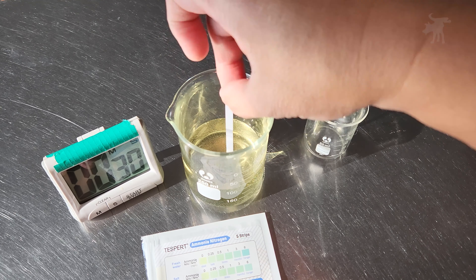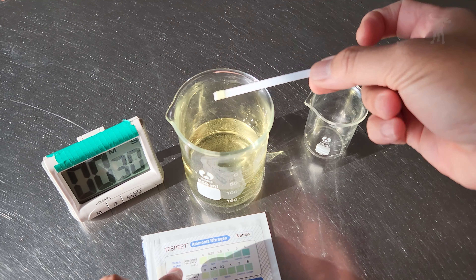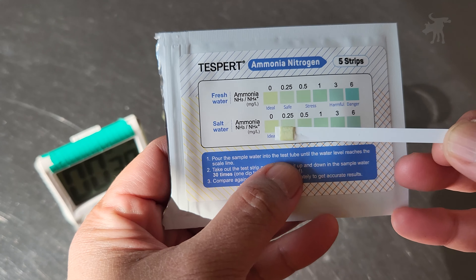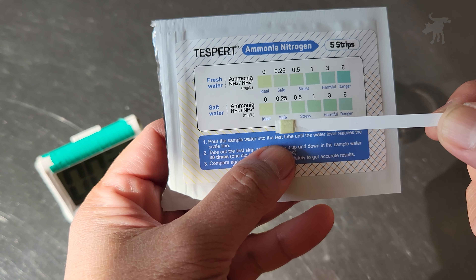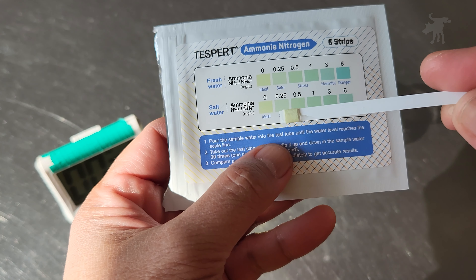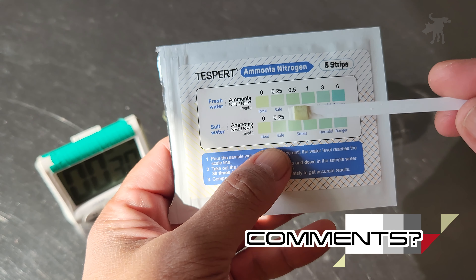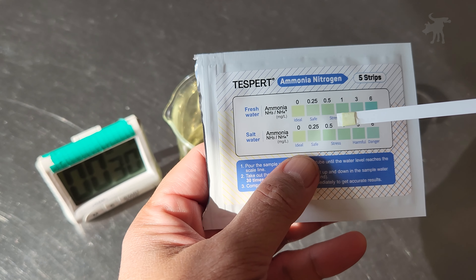We'll just do this for about 15 seconds. Let's see if there's any changes to that. A little bluer. So technically it did change color, but could I use this as a practical means to test for wastewater contamination in my water supply? Probably not. Let me know in the comments what you think. But I think at best this test is inconclusive, since that was my goal. Your goals may be different. Let's go on to our next test.